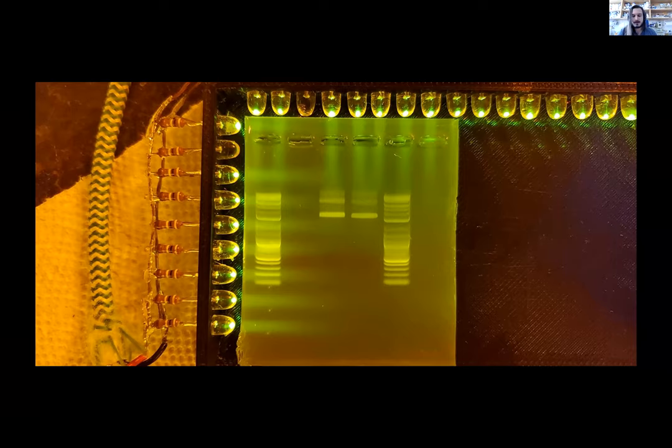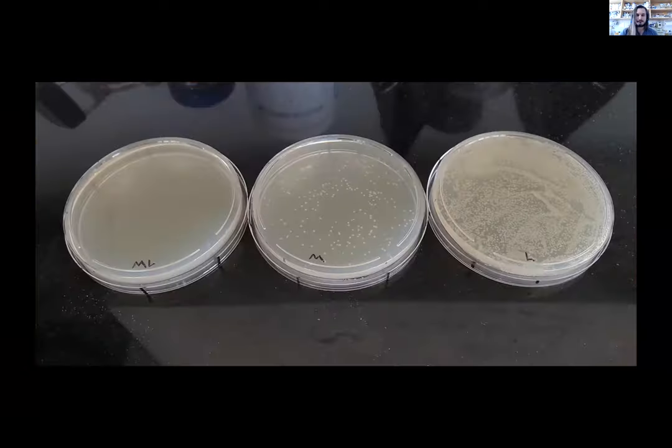And so in that concept of tuning, I said, all right, you know what? Let's try first transforming it. And so I transformed those three samples that I reacted, and methylene blue with light, I got nothing. Methylene blue without light still gave me less colonies, and then just light without methylene blue gave me essentially a lawn. So there was a reaction even without light, like stray photons, or it wasn't covered that well. Whatever it is, it's reactive. And this was plasmids that I transformed.